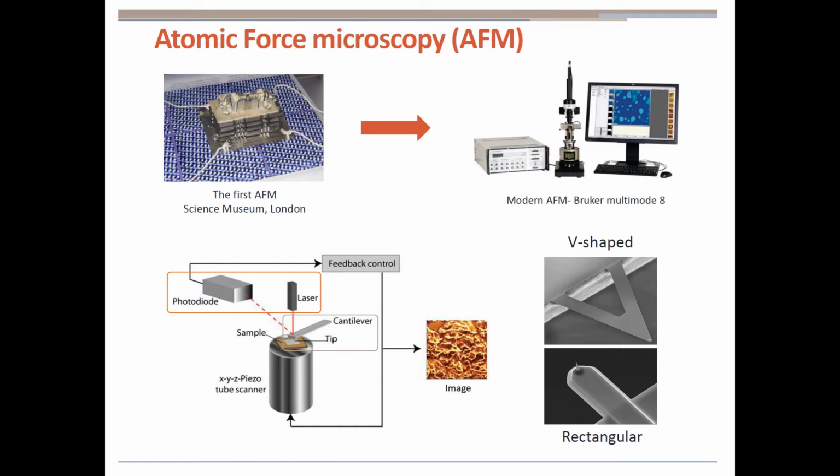After several decades of development, we now have this modern AFM. Instead of using the STM tip, the deflection of the cantilever is detected by the reflection of a laser beam.